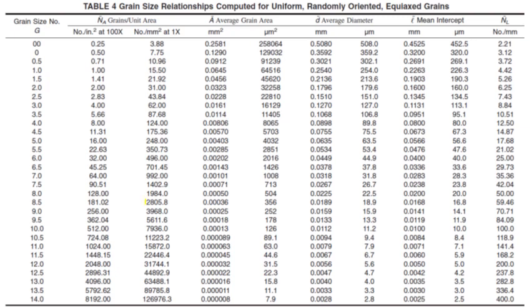Here's our closest value to the 2874 in column 3. So that would go to a grain size of 8.5 or a little bit higher, 8.6 in terms of ASTM grain size number in column 1.